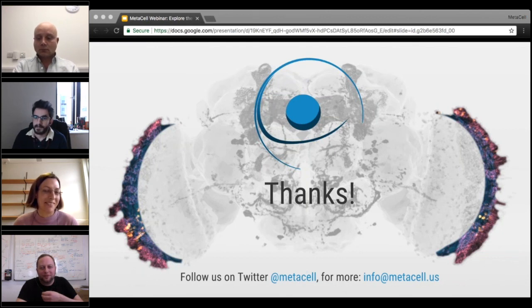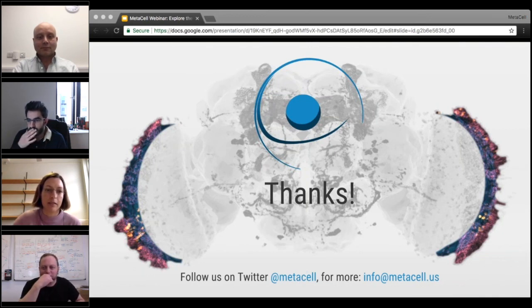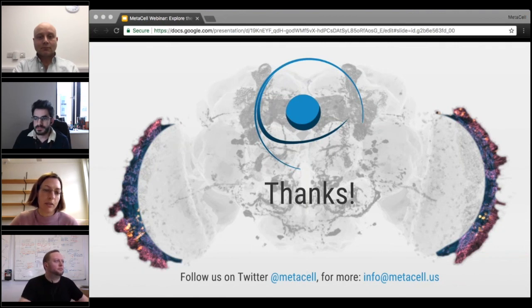that all of these NBLAST tools and image registration and a lot of the analysis that have been developed for the NBLAST paper, but also other tools in Greg Jefferis' lab, they're all based in R, and so you're able to do quite more complex queries other than just the web pages that you've seen. So you can do queries getting all the neurons in a specific region of the brain other than the neuropils.